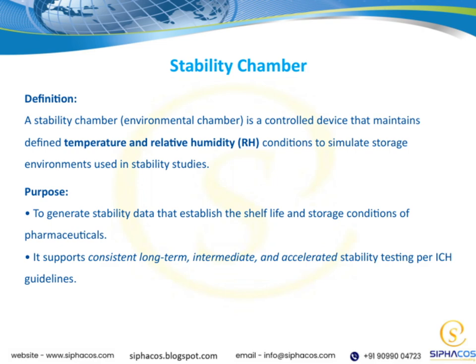Additionally, stability chambers support different types of testing: long-term, intermediate, and accelerated stability testing. And all of these are performed in accordance with ICH guidelines, which are the international standards that ensure consistency and reliability in our results. So, in the broader context of our presentation, understanding how these chambers work and why they're so critical helps us appreciate the rigorous processes behind ensuring pharmaceutical stability and safety.